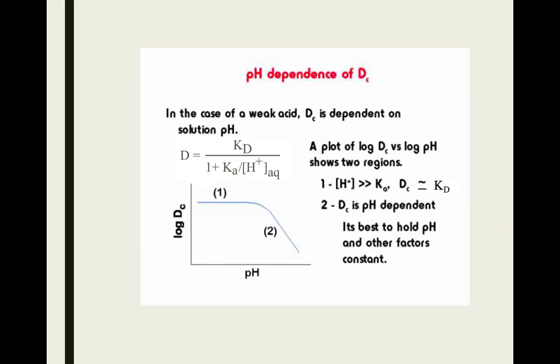It's not just straightforward. You can't do it without any buffer. You have to use a buffer, and you have to find out which buffer range is suitable for the most optimum extraction. So this is very important in extraction procedures.